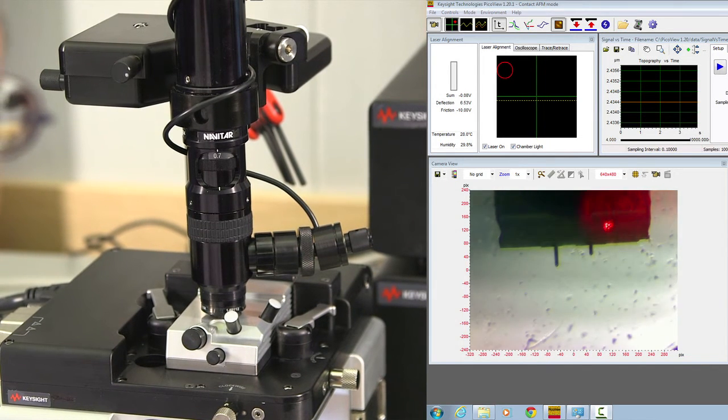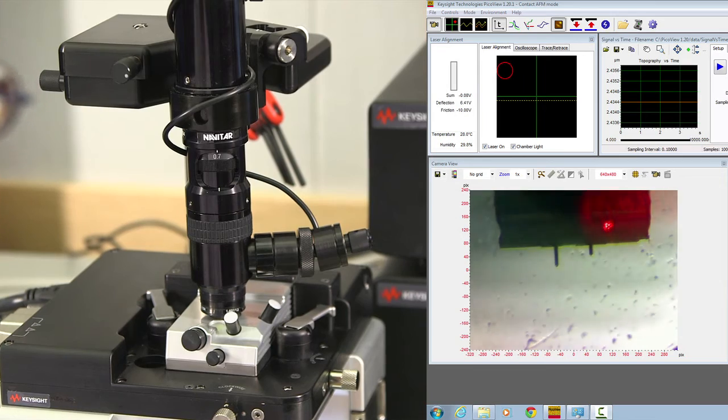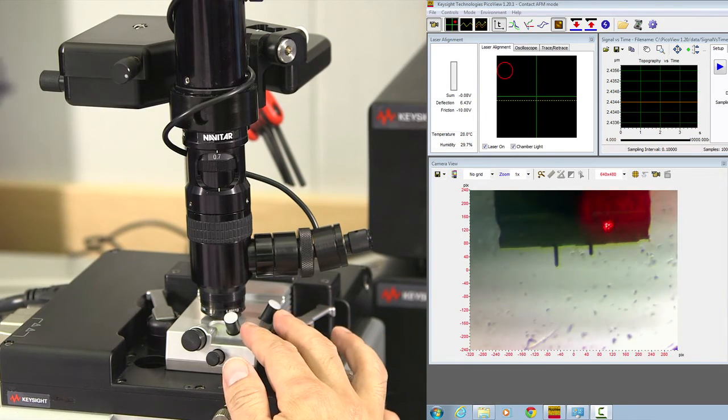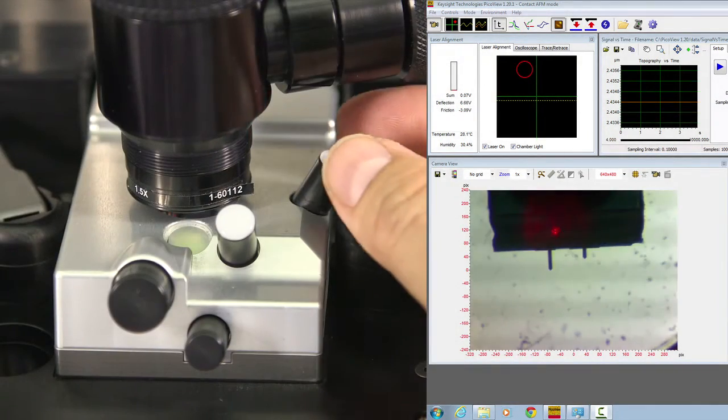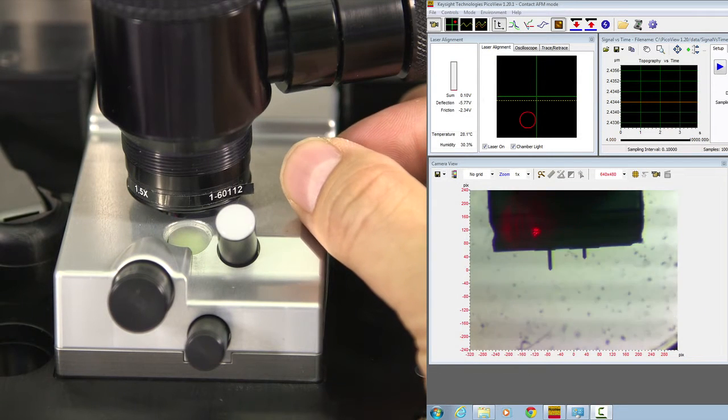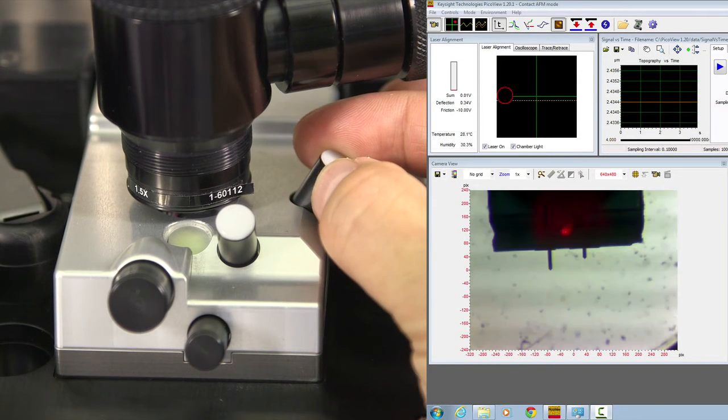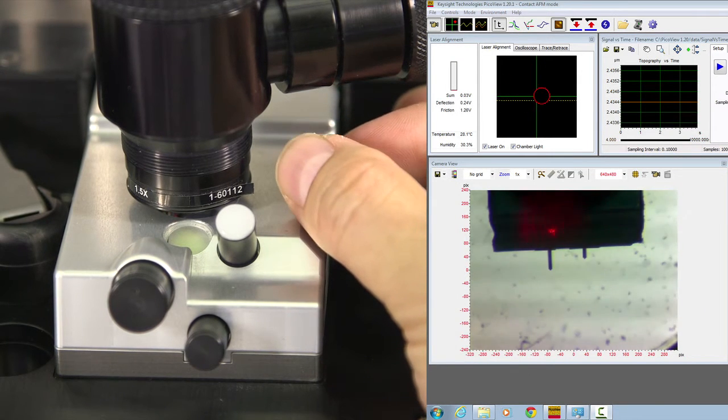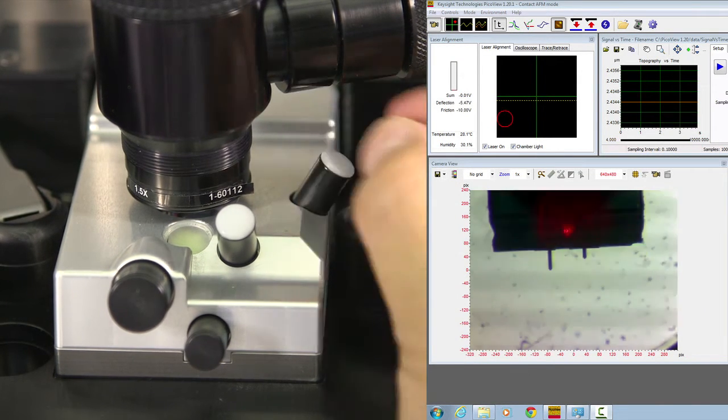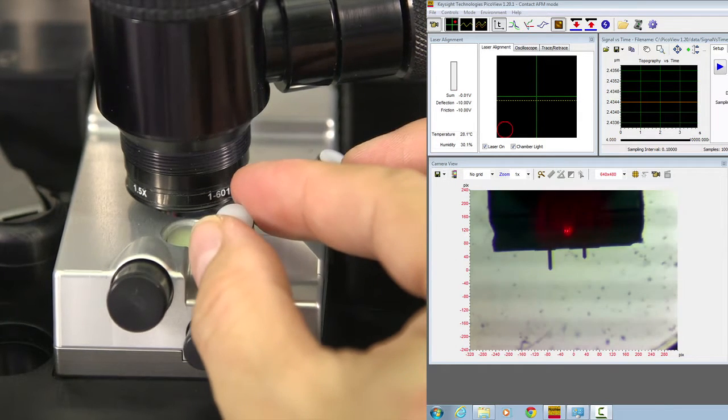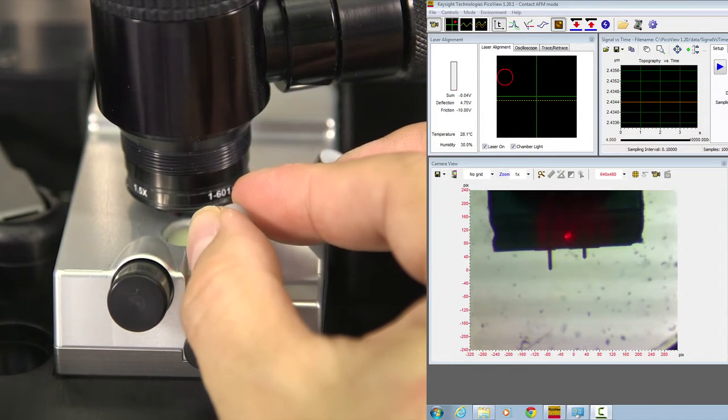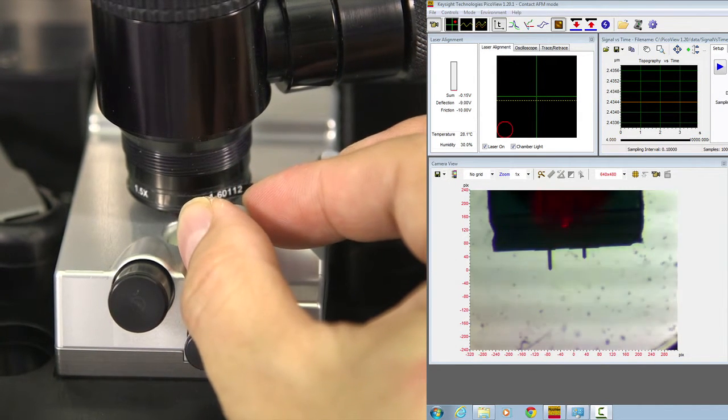Now, the laser alignment adjustment knob is on the scanner. The one on the right-hand side moves the laser spot left and right. The knob on the front moves the laser spot up and down.